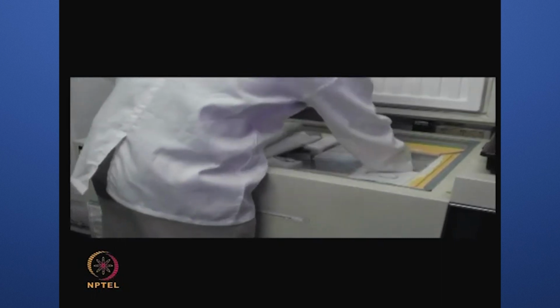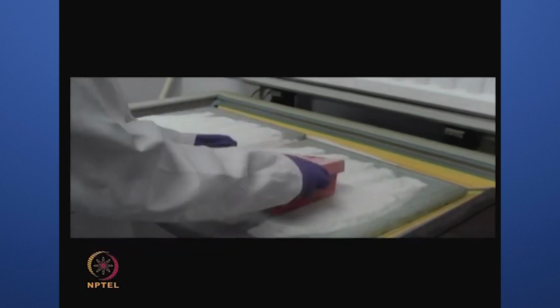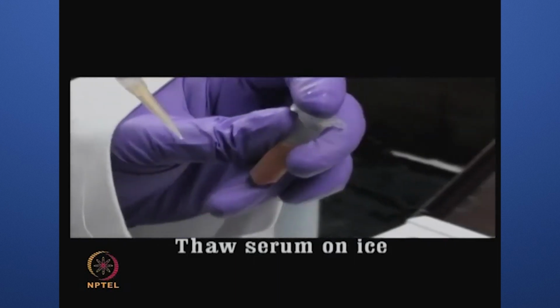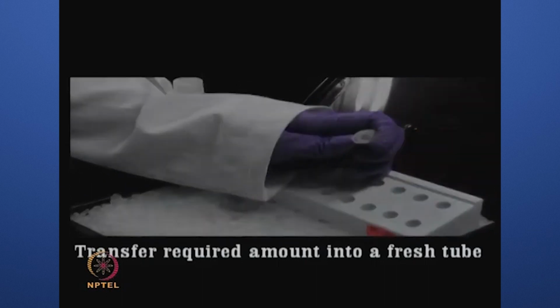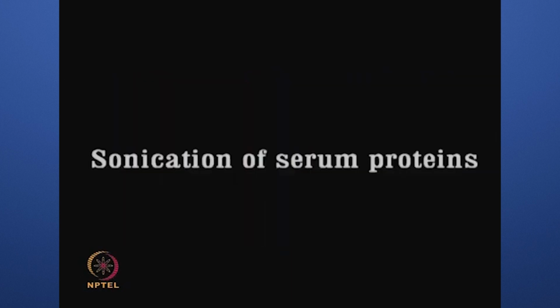Remove the serum sample from the freezer at least 15 minutes before performing the experiment. Place it on ice and allow it to thaw before use. Then transfer the required amount of serum into a fresh, clean tube. Sonication.